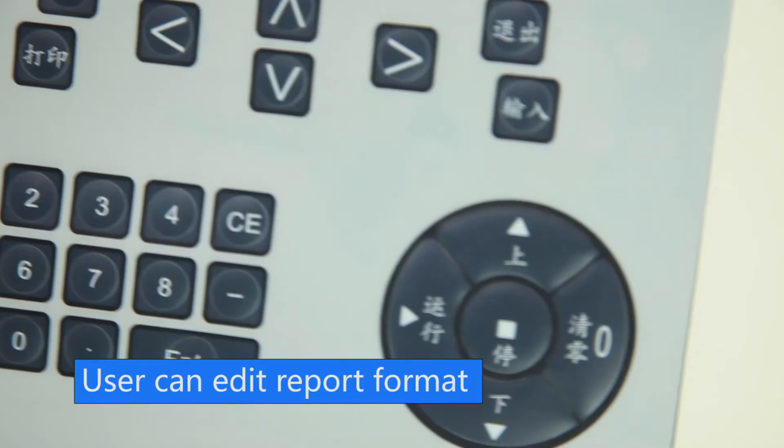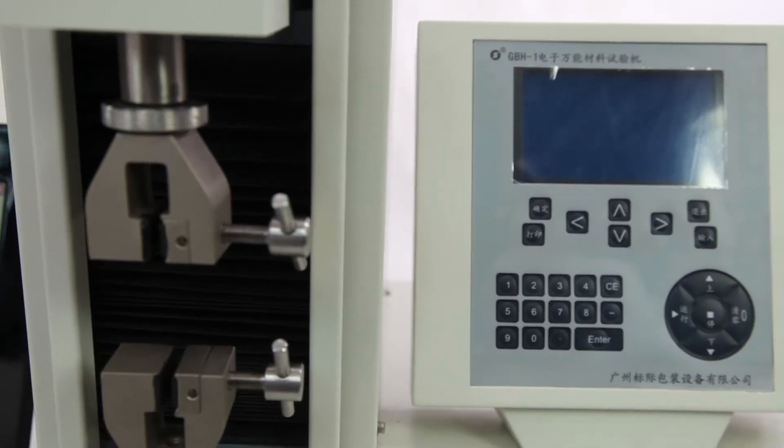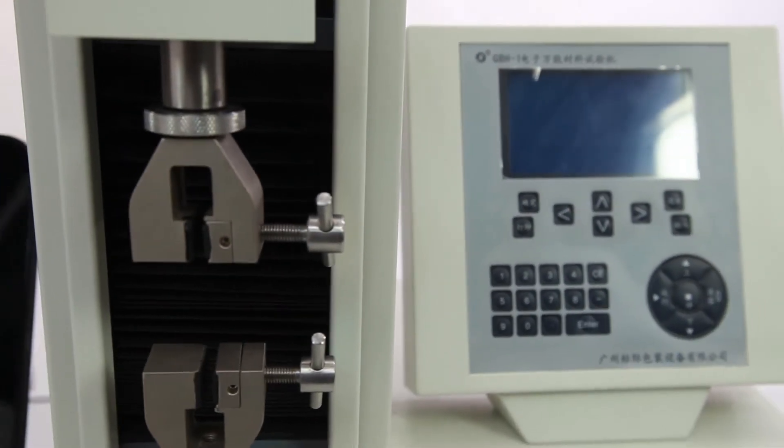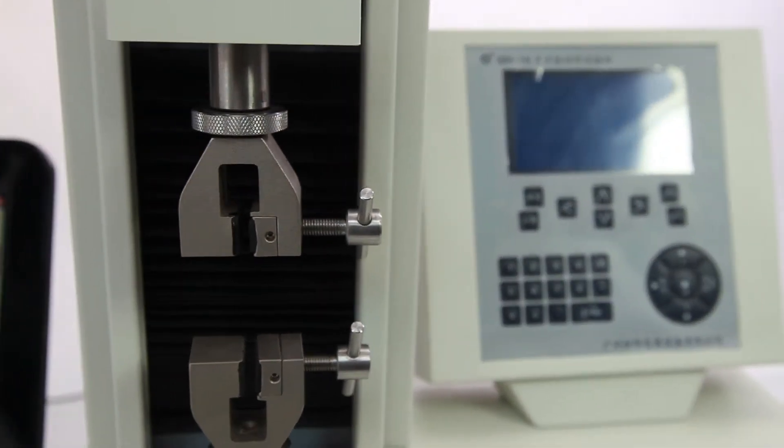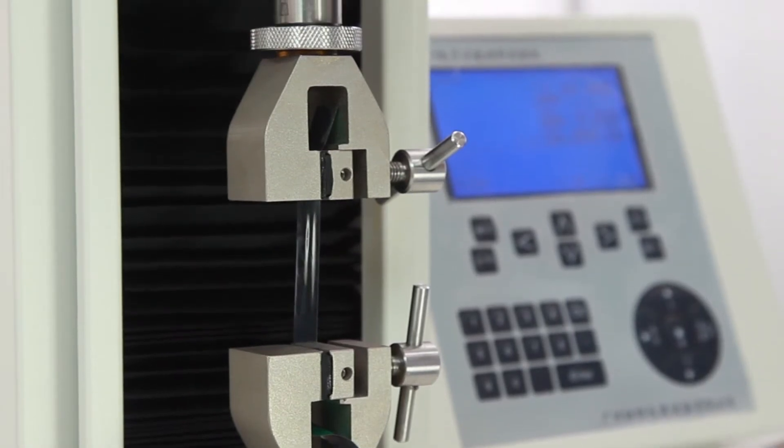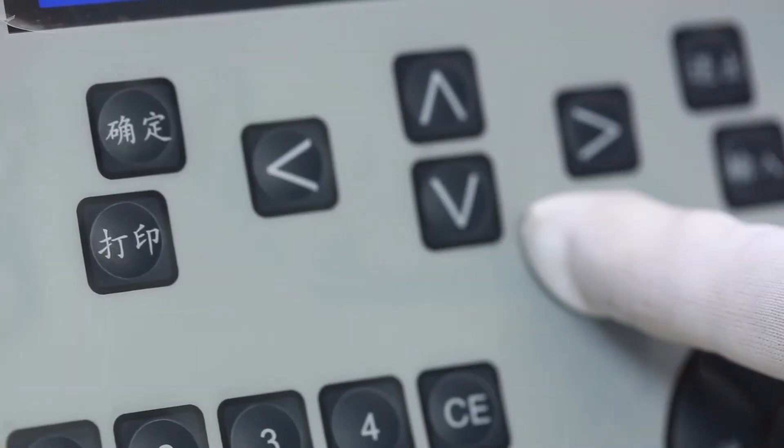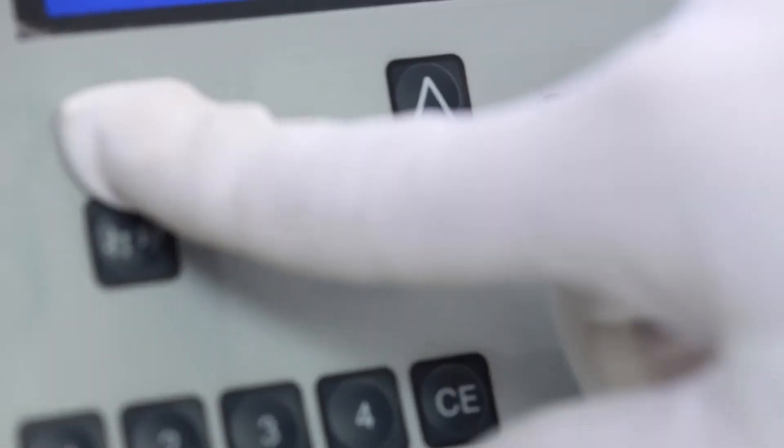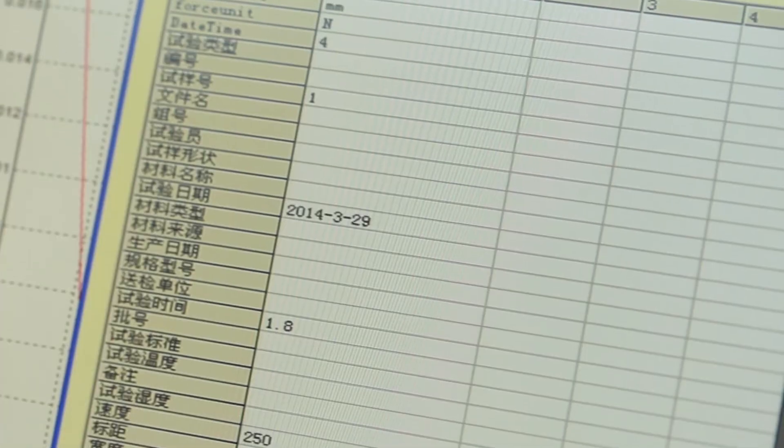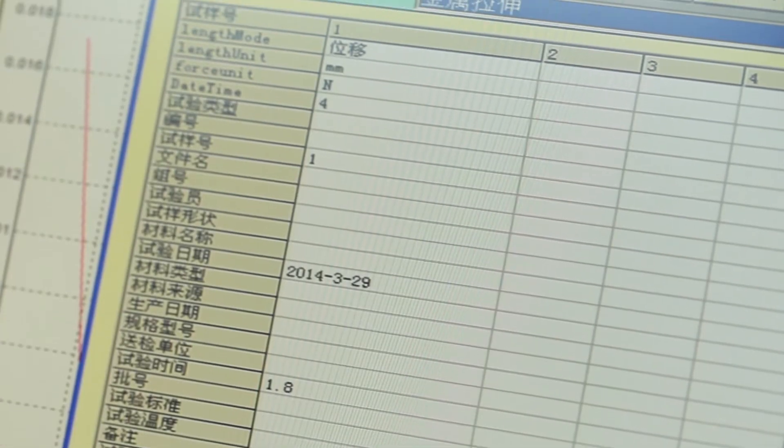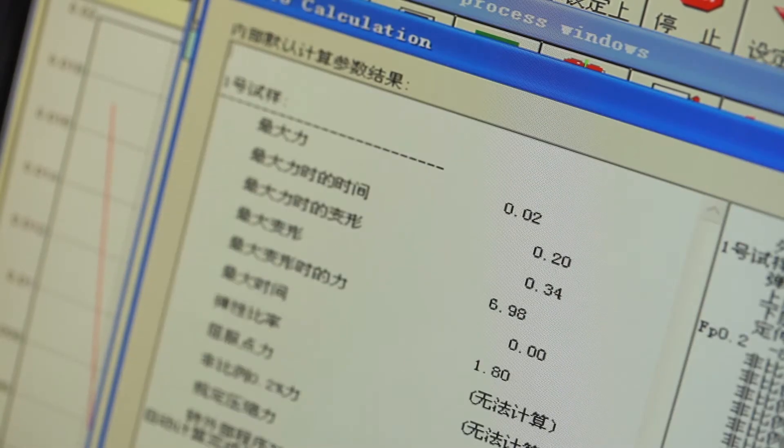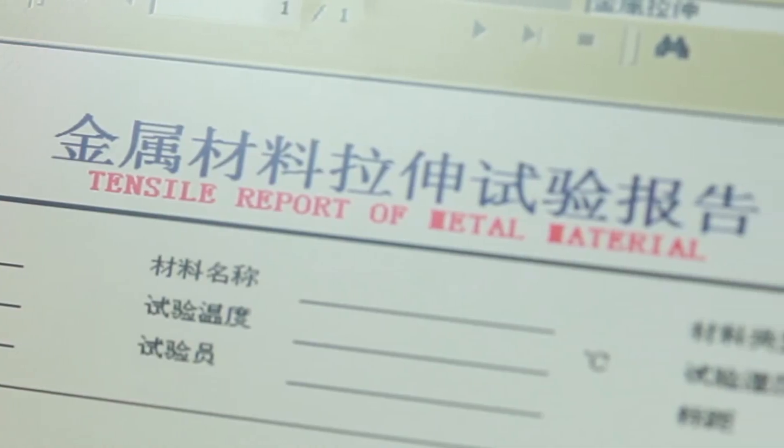User can edit report format. It is modularized in design and can extend function. The whole tester process can be controlled by computer with online display of test results, automatic data processing and storage, multiple curves display and analysis, and can print reports.